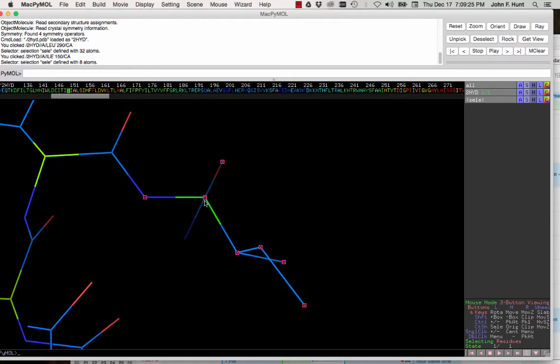The 0 position of the CO bond would then be trans to that, or horizontally to the right. It is instead rotated about 60 degrees upwards. In this orientation, where we're looking with the N terminus towards us and the C terminus away from us, the positive rotation by the right-hand rule would be down. So the CO is actually rotated about negative 60 degrees around the C alpha C bond, and so this is a psi angle of negative 60 degrees.